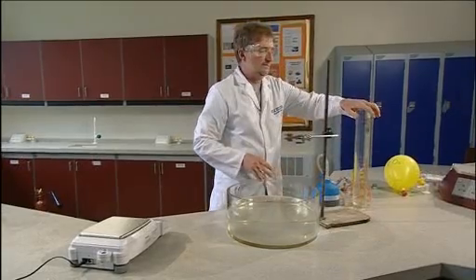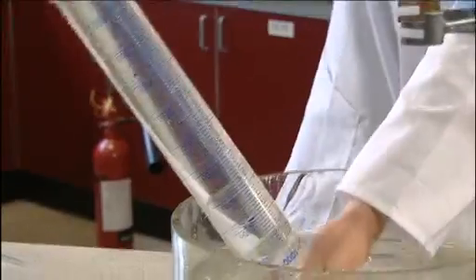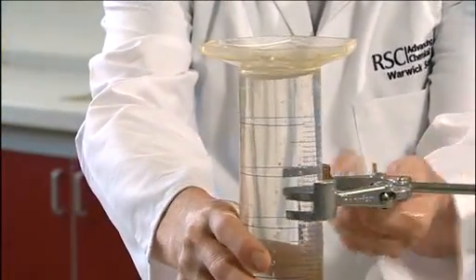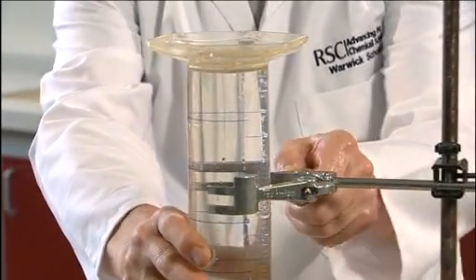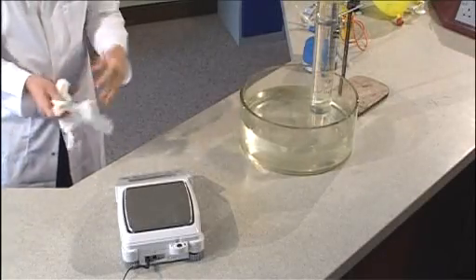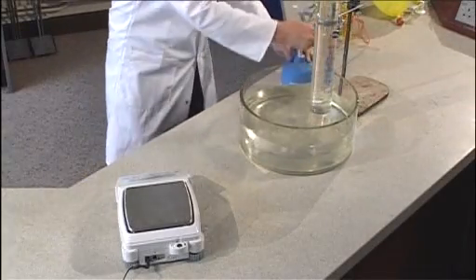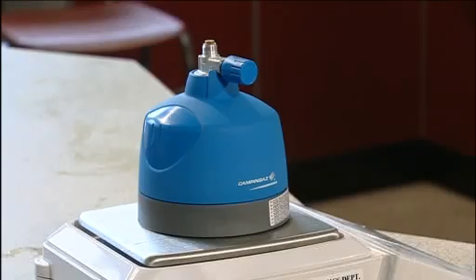We collect the gas in an inverted measuring cylinder full of water. This inevitably involves getting your hands wet, so it's a good idea to have some tissues available to dry them, because you don't want to get droplets of water onto the canister. Remove the delivery tube and weigh the gas in its cylinder.